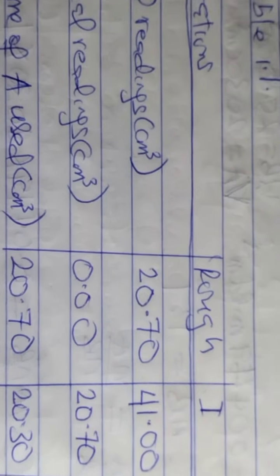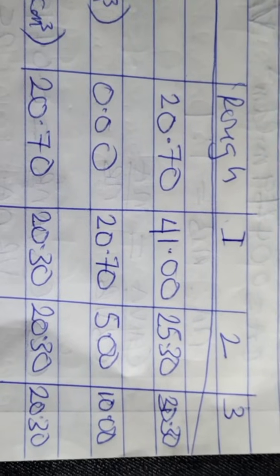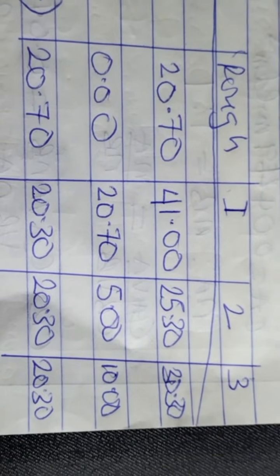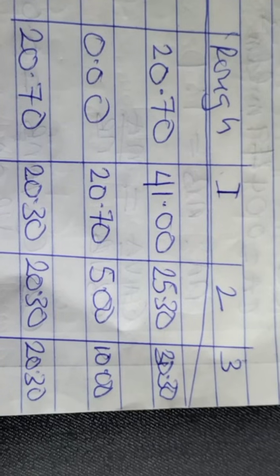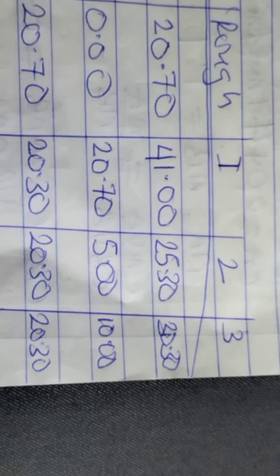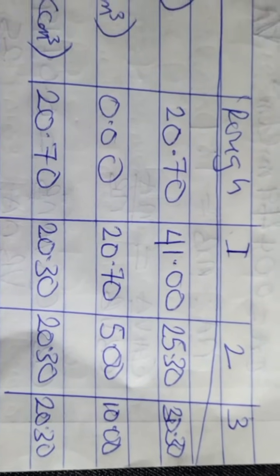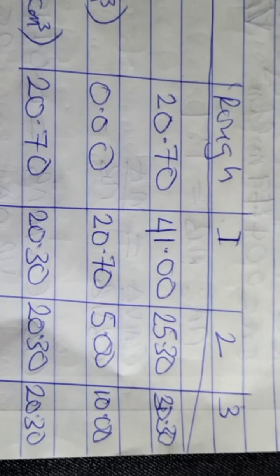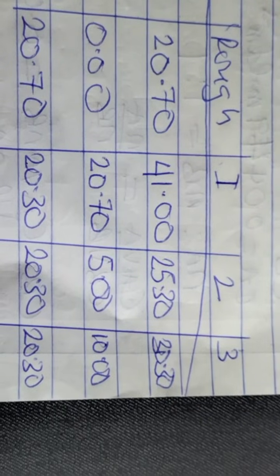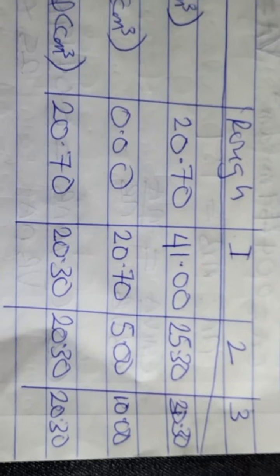So there are a lot of things you have to avoid on this table. You don't have to put your readings to one decimal place, that is, readings like 20.7, 41.0, 25.3, 30.3 are wrong. All the readings here must be to two decimal places. 0.0 is wrong, or ordinary 20 is wrong, or ordinary 41 is also wrong. So all the readings there must be recorded to two decimal places, please.